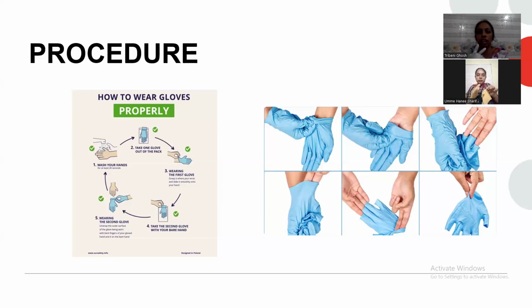Just so I understand now, if I just sterilize my hands with a hand sanitizer, then it's okay to touch anywhere on the glove? Yeah, you can touch anywhere as long as your hand is sterile. But after the examination of the patients, you have to be careful. That's safer when you do experiments.